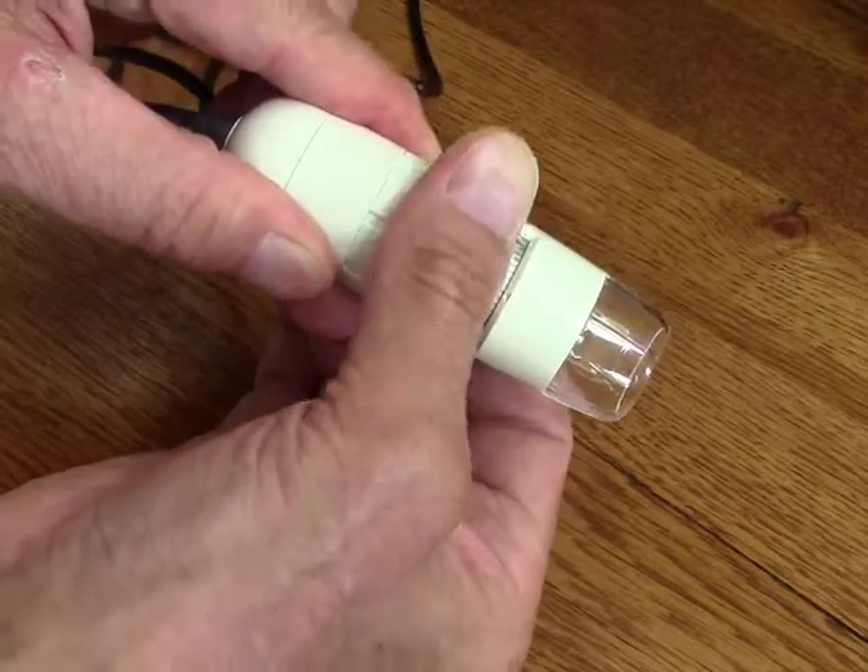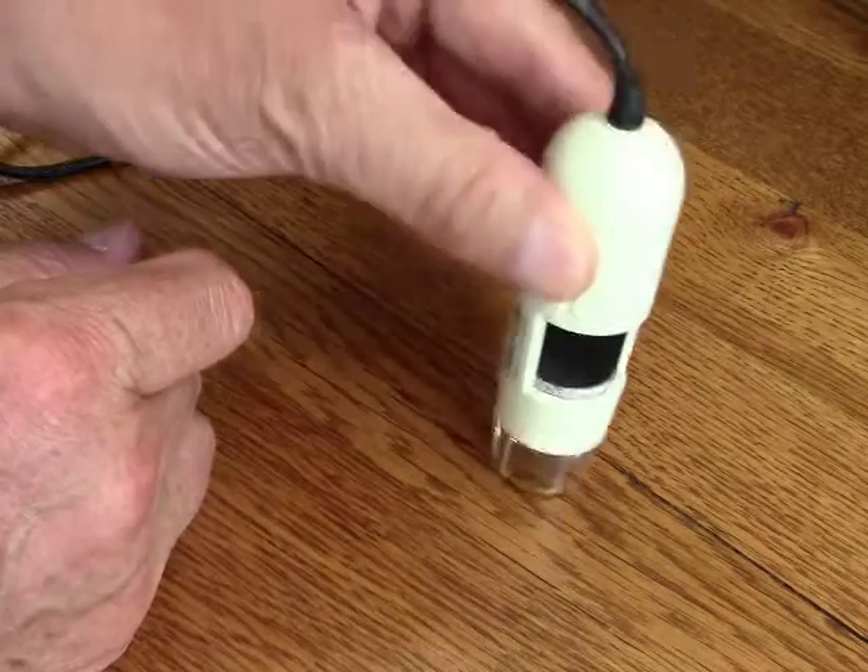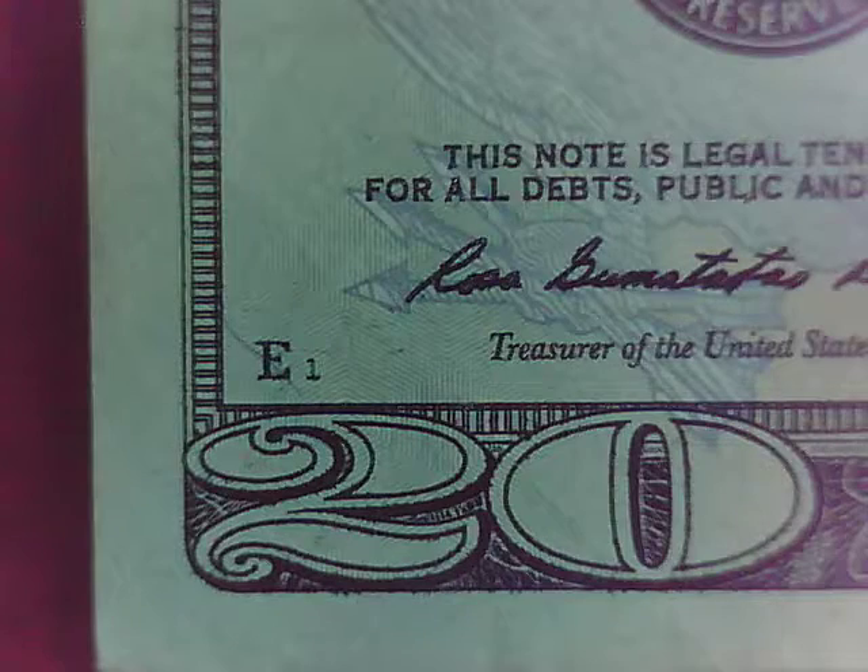This is kind of a focus and magnification wheel — depending on how close or far away you are from the object is going to determine the level of magnification that you get. And then you use this to dial in the focus.